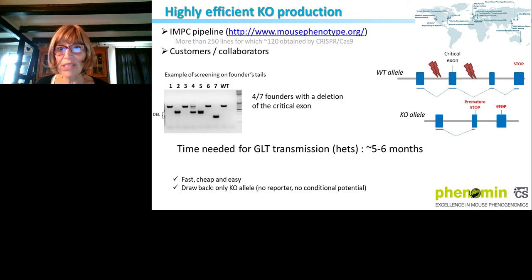This exon, when it's not there anymore, the deletion of this exon will generate a frame shift and lead to a premature stop codon, and so lead to a knockout. Of course, we also do these knockout models for collaborators.